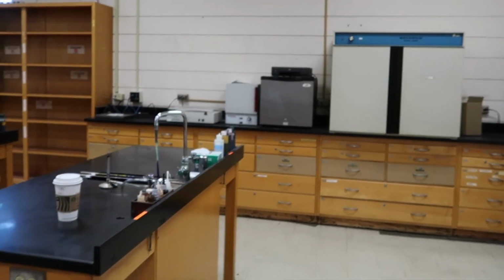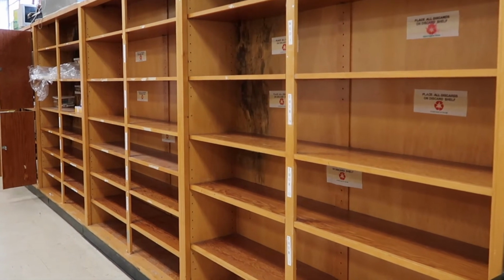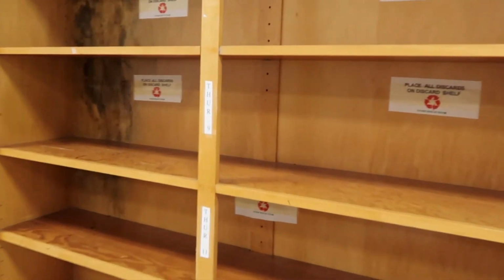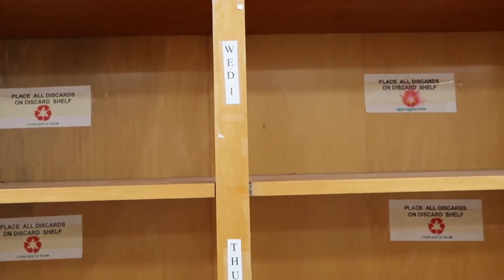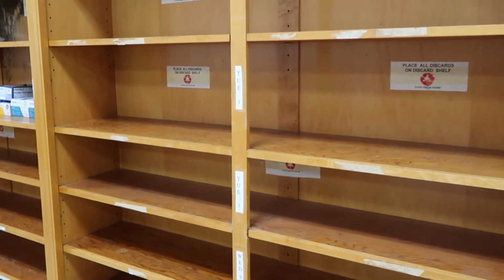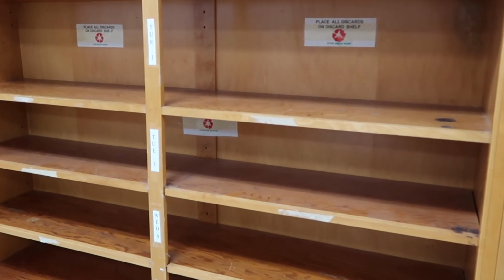Now, there's another shelf in here that's of importance. Depending on which class you're in, you're going to have your own labeled shelf. So these shelves over here, this is where the gloves are kept, but these are labeled, okay? So if you're in the Thursday at 9 class, the Wednesday at 1 class, these are where all of your samples are going to go, your cultures. So whenever we have to have something incubate for the week, and we're done with it, your instructor will tell you, go put this on your shelf. These are the shelves we're talking about.